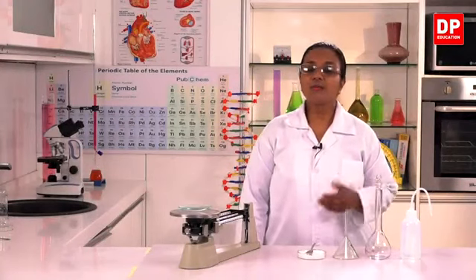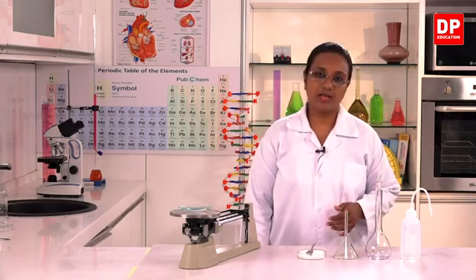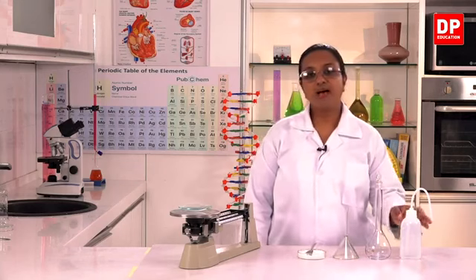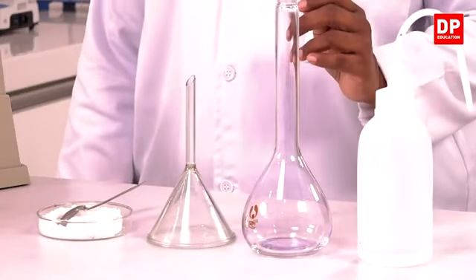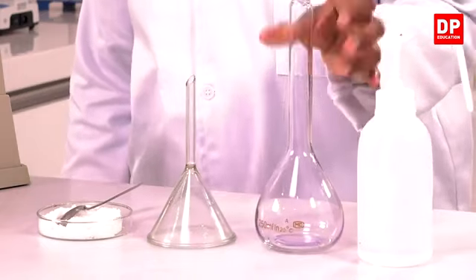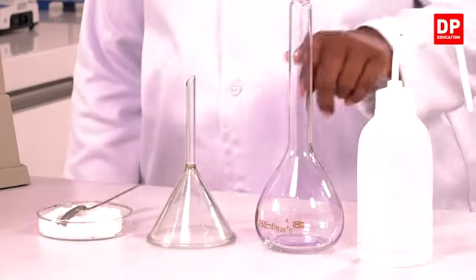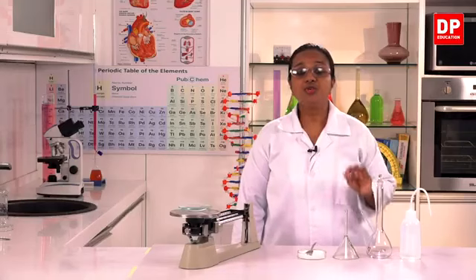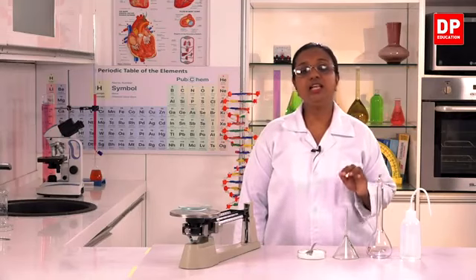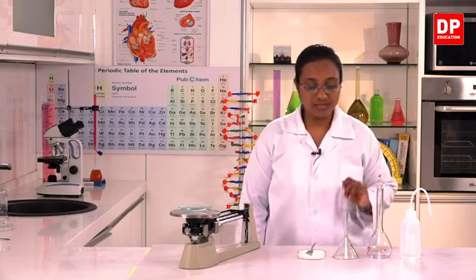So now I am going to prepare a standard solution of sodium chloride. To do that, I have a wash bottle with distilled water, a volumetric flask. You can see it is a 250 centimeter cube volumetric flask. And here you can see the volume mark. We have to fill water up to this point so that we get exactly 250.00 centimeter cubes of the solution.